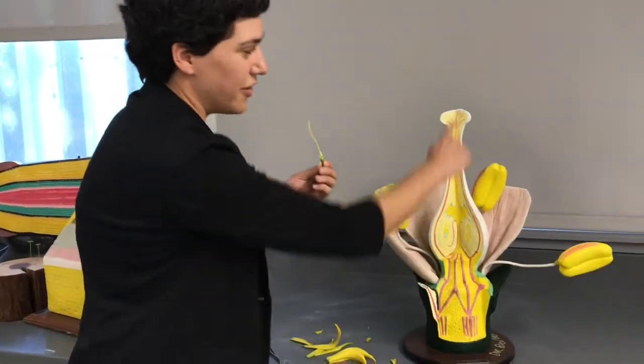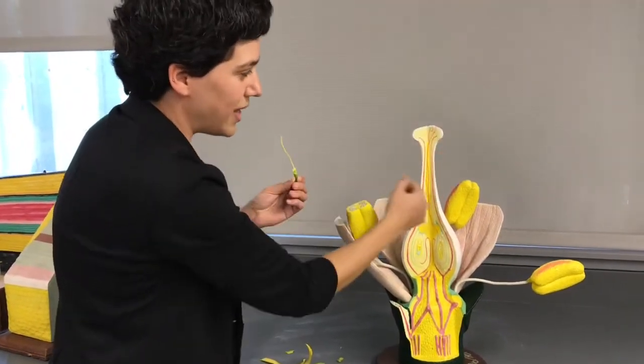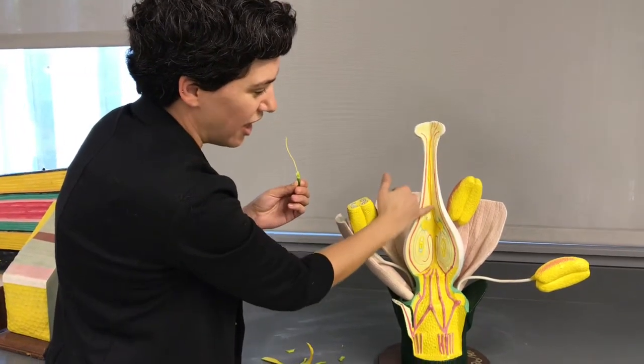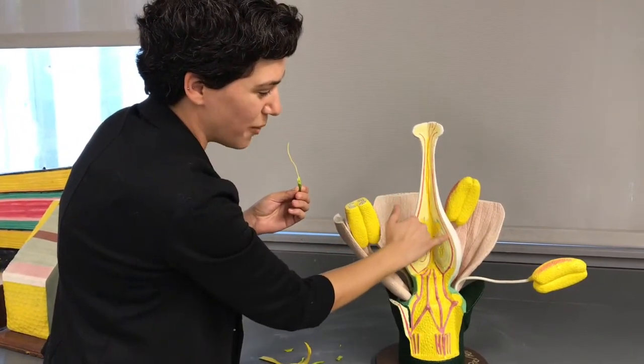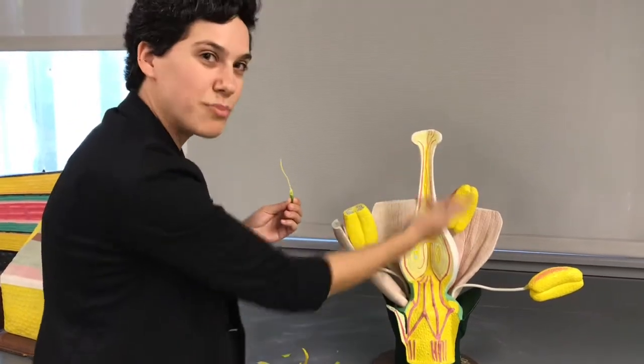Here on this model, this is the stigma. And we actually have drawings of pollen tubes growing down the style of the carpel on this model.